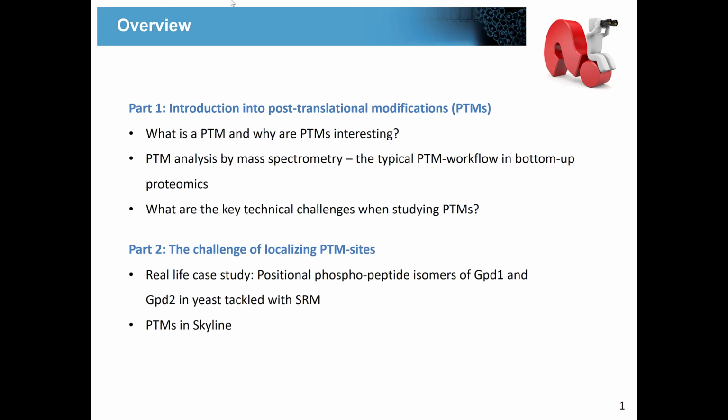And I would like to end this first part with some key technical challenges that we are facing currently in PTM studies. And that will also then bring us directly to the second part, where I would like to look with you into one specific challenge, which is the localization of PTM sites. And we will look at one real case study from myself where the purpose was to position phospho sites on peptides. And in the very last part, I would like to just briefly show you a little bit how PTMs can be set up in Skyline itself.